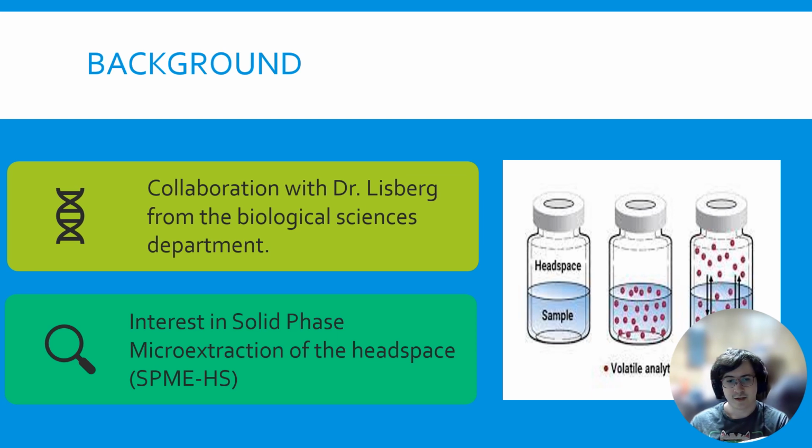What got me specifically interested in using solid phase microextraction, or SPME-HS, because we're looking at the headspace, is a cockroach video where we put the little fiber into the headspace. In the cockroach example, the sample would just be a bunch of skittering cockroaches.